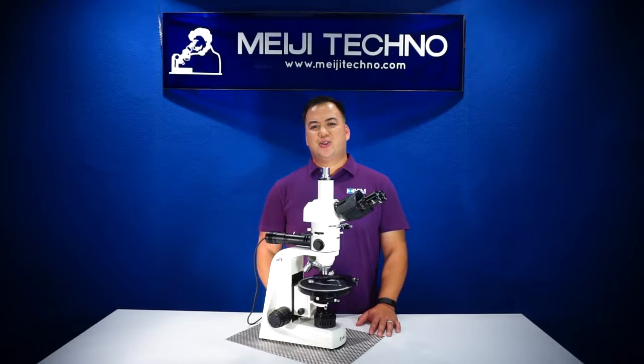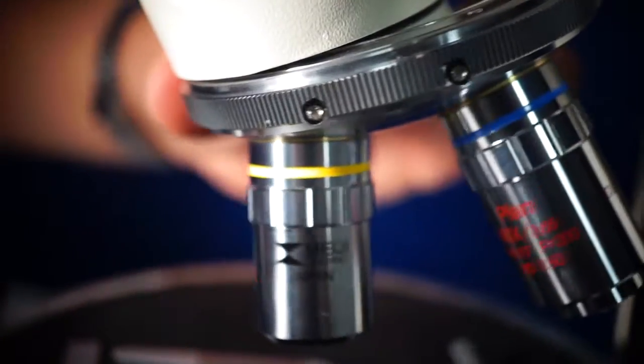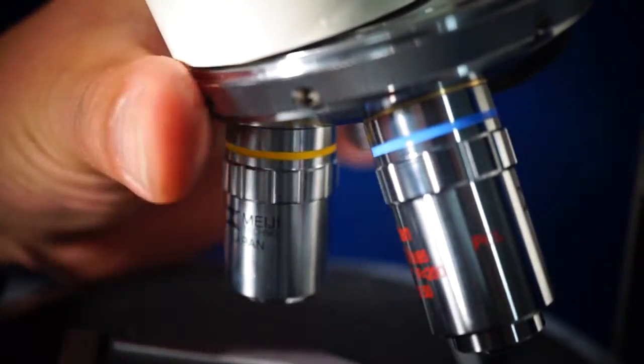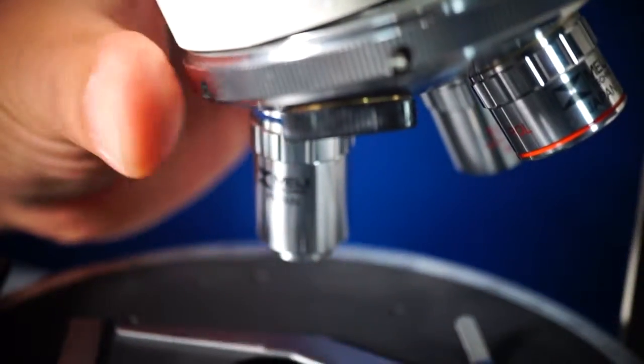The MT9900 series is normally equipped with infinity-corrected plan strain-free 4x, 10x, and 40x objectives. Optional strain-free 20x, 60x, and 100x oil objectives are also available. All can be smoothly rotated on the rotatable ball-bearing quadruple nosepiece.